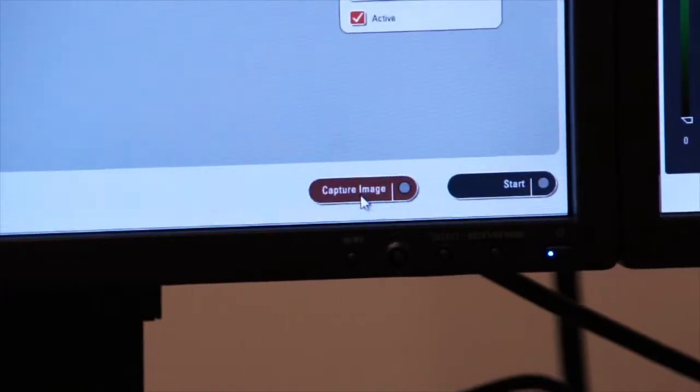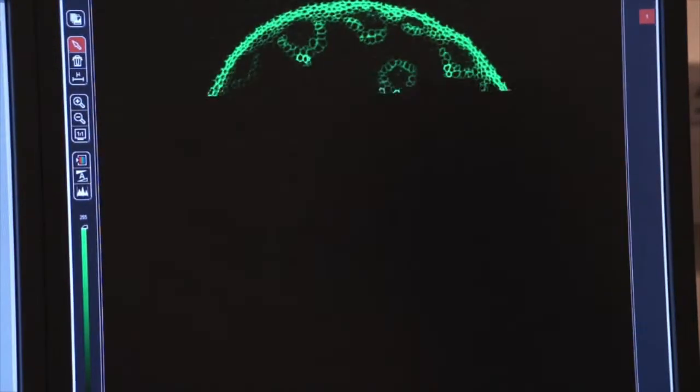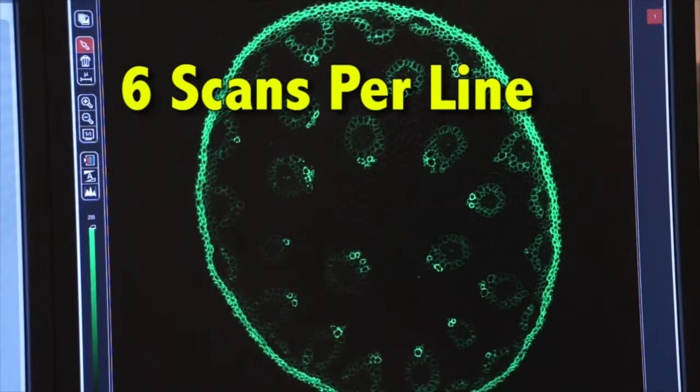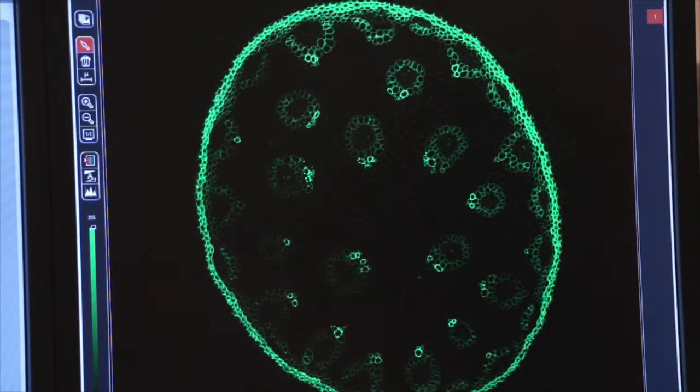So if I click on capture image now, I'm telling the system to gather an image and it's going to take six scans per line. Now you can see that was a little slower than capturing an image with one scan per line. So let's switch back to one.